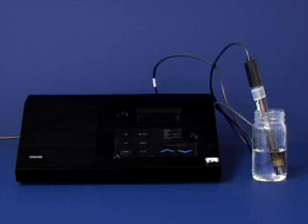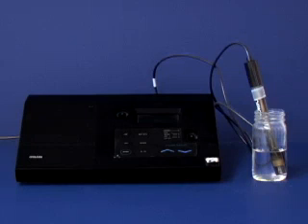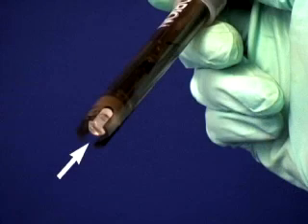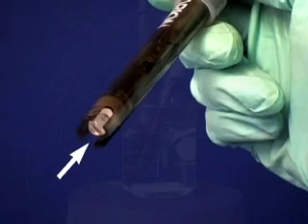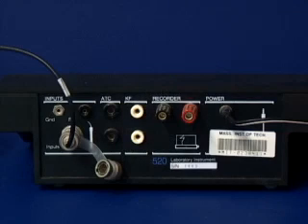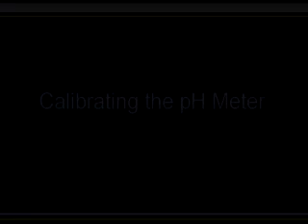This video will demonstrate the use of an Orion SA520 pH meter. The important components of a pH meter include the display, the probe, and the electrode tip. The electrode tip contains a fragile glass bulb — be extremely careful not to hit the probe on the side of a beaker and when using stir bars. To operate the pH meter, first make sure that the electrode is connected to the meter. Then calibrate the pH meter. The pH meter must be recalibrated every time you turn it on and after three to four hours of use.